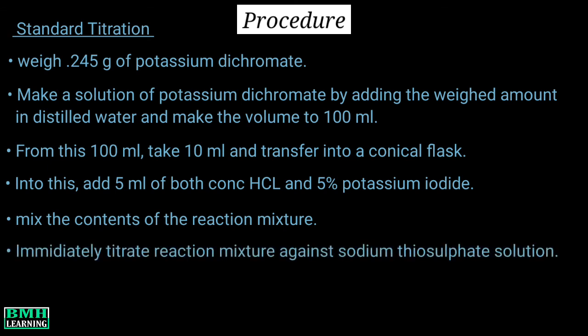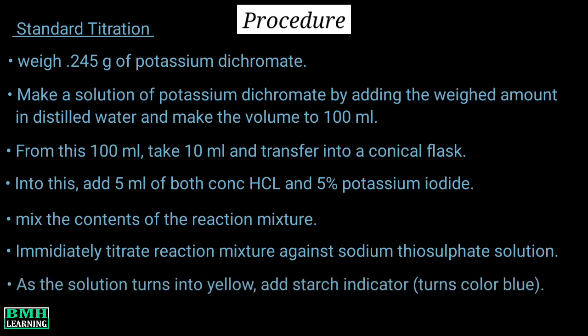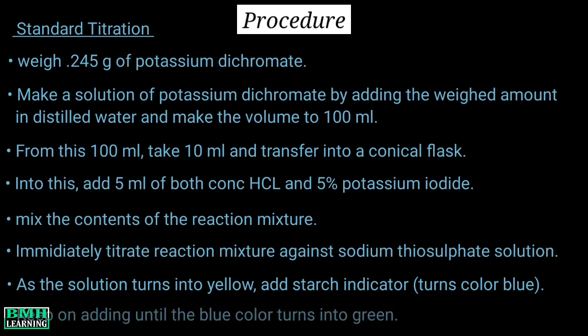Immediately titrate the reaction mixture against sodium thiosulfate solution. As the solution turns yellow, add starch indicator, which will cause the formation of blue color. Keep on adding until the blue color turns into green. At this point, the reaction is complete. This was all.